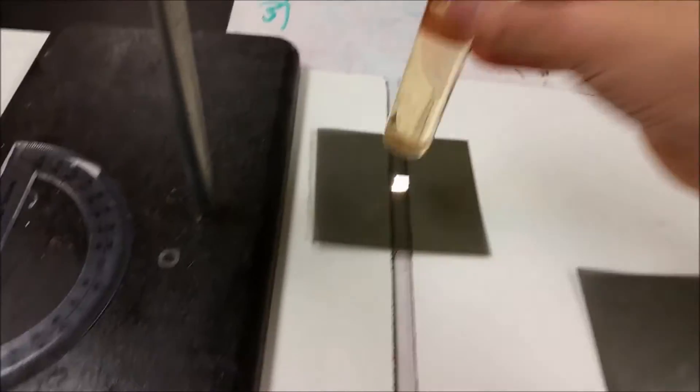So here's 90 degrees. Here's a little more than 90 degrees, and so we can see that the plane of the polarization of the light has been rotated as it passes through this chiral sample. So this sugar solution is able to affect the plane polarized light.